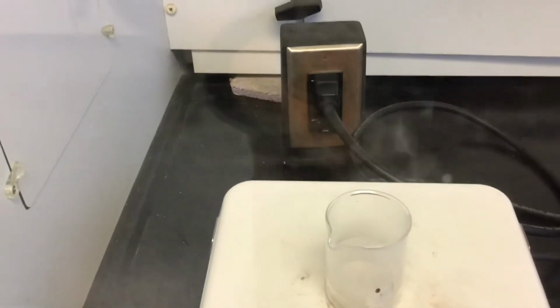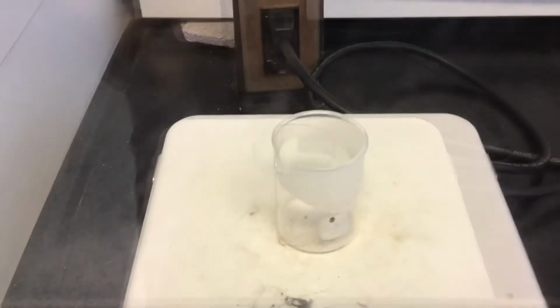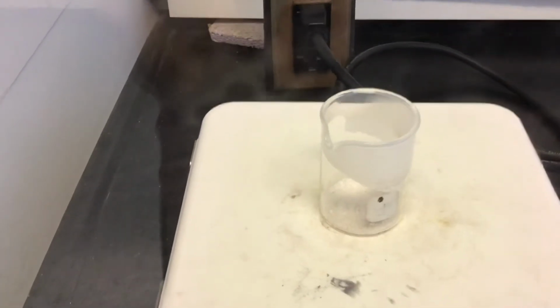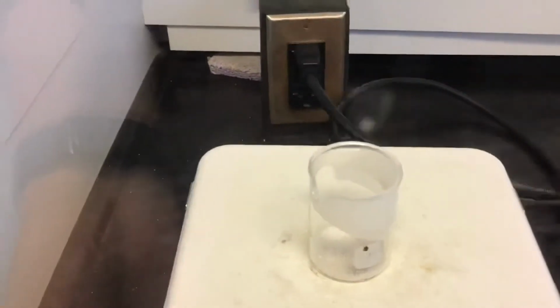Okay, so it's just subliming. When it gets done subliming, I will show you what it looks like. You can tell now that the ammonium chloride is mainly out of the sample. There's not as much fumes coming off, but you can see around the top of the beaker. Let me try and point that out to you.